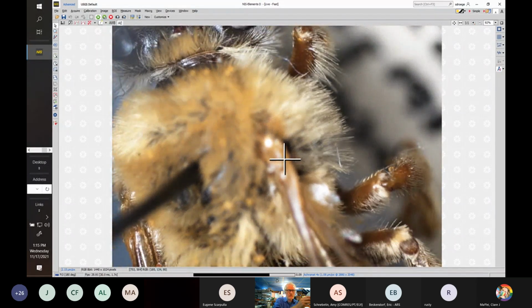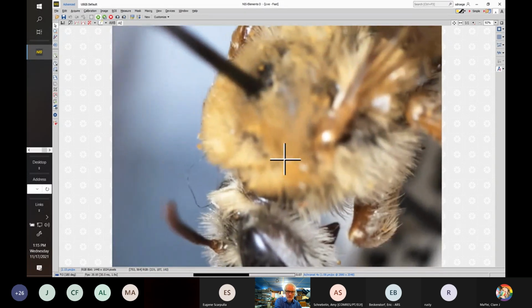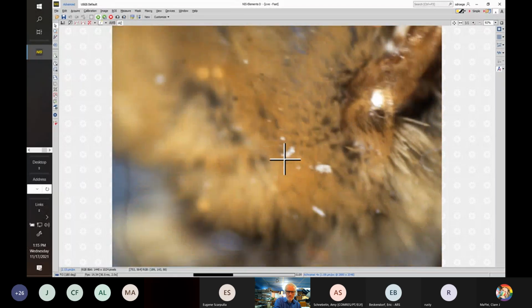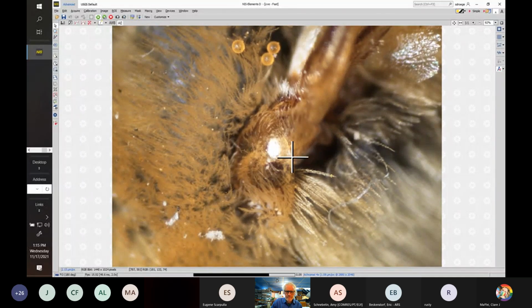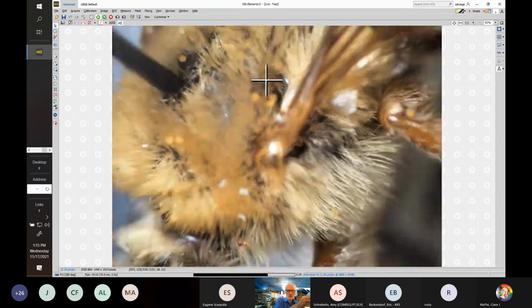And so it doesn't narrow towards the tip, nor does it, interestingly, look like it has a great degree of hair on it, which often Melissodes and Svastra do. So we'll look at it from a different direction here. Very transparent. So a bit difficult to see completely, but roughly you can see the shape somewhere in here. And I believe this is the, I think squash have very large pollen grains. So look at the size of those bad boys. I'm going to say that's squash on it.